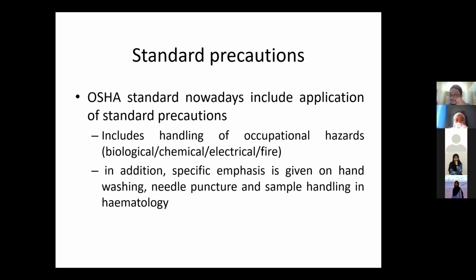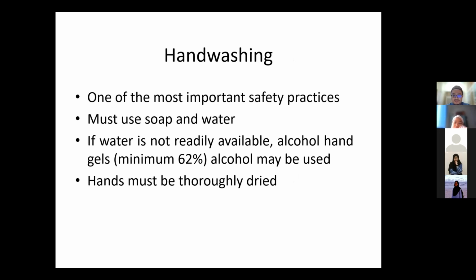These days we follow OSHA, which provides us with the standard for precautions, how to handle occupational hazards. They give specific emphasis on how to wash hands. There is a way to wash our hands, actually. How to handle needle puncture and how to handle certain samples in hematology.